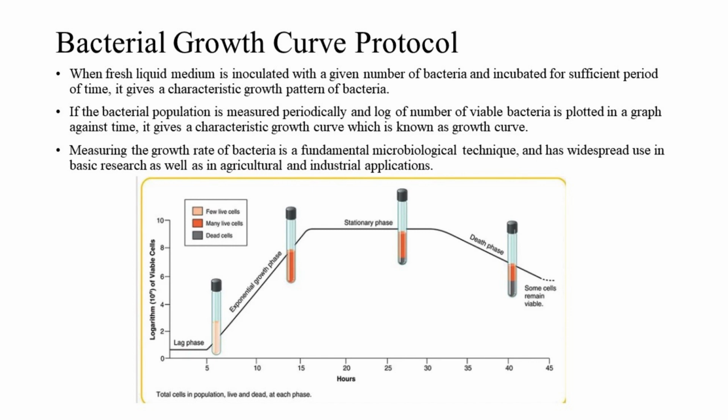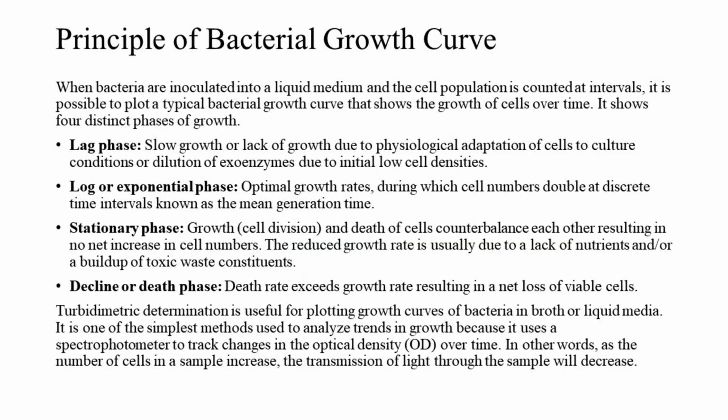Measuring the growth rate of bacteria is a fundamental microbiological technique and has widespread use in basic research as well as in agricultural and industrial applications. Principle of bacterial growth curve. When bacteria are inoculated into a liquid medium and the cell population is counted at intervals, it is possible to plot a typical bacterial growth curve that shows the growth of cells over time.